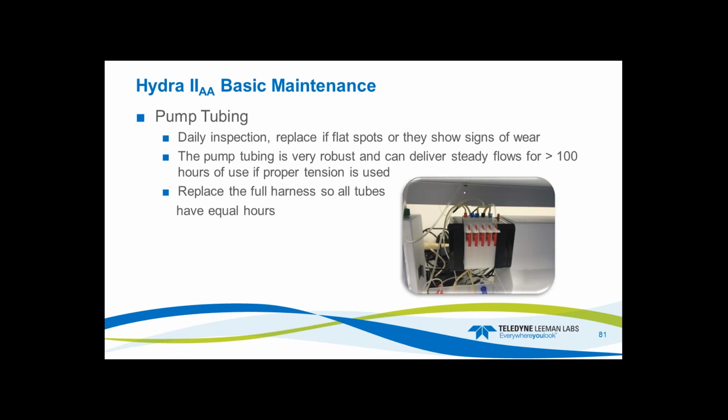Pump tubing, you're going to inspect that daily. If it shows signs of wear, just replace them all. If the tension is set properly, the pump tubing should last for greater than 100 hours of use. It's Santoprene tubing. It's very robust. But if you need to change tubing, I recommend changing all of them at the same time so they all have equal hours. Don't change one and leave the other because then you're just asking for problems.